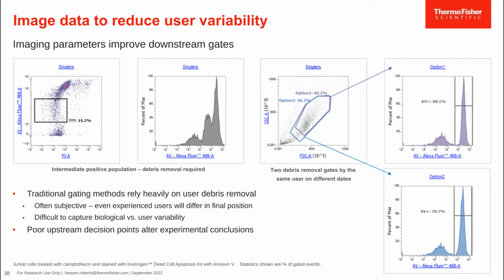And I think we've all seen this, and it's a known issue with flow cytometry, that we have to be very robust and careful with our gating, especially when we go from sample to sample and day to day, where we will have mild variations because of biology or instrumentation or staining. So if we look at this compared to, oops, I apologize.